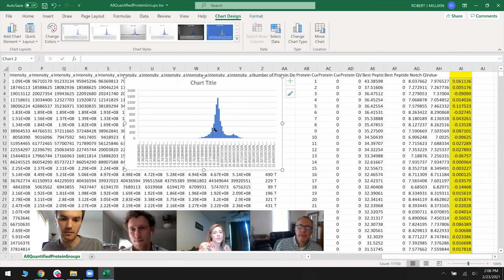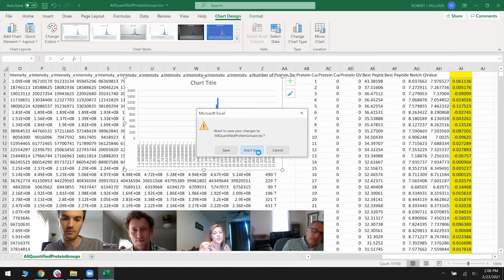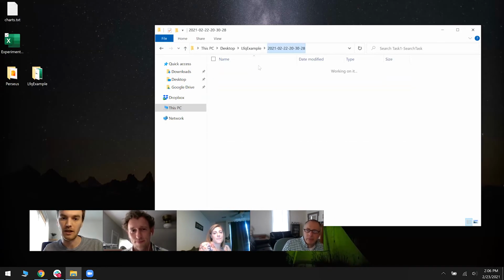And you can see like there's a peak around 0. Those are the human proteins. And there's a peak around log base 10 of maybe 0.4 or so. And that's the yeast proteins that are changing. So another cool way to look at it is you can plot it. I've already pre-made some graphs.